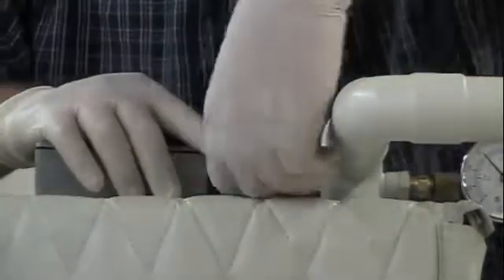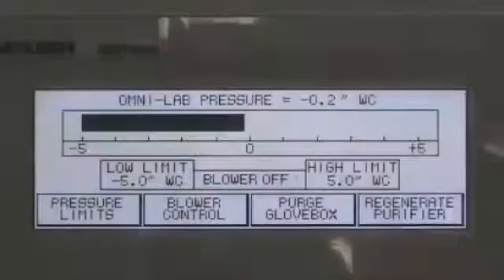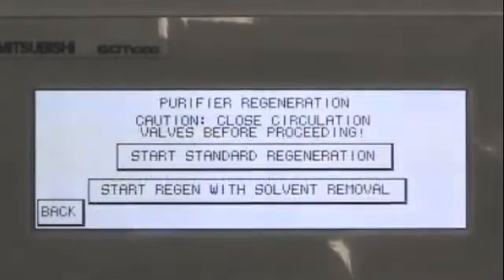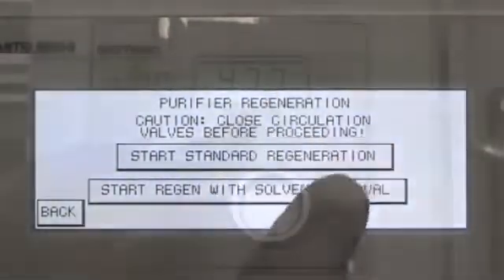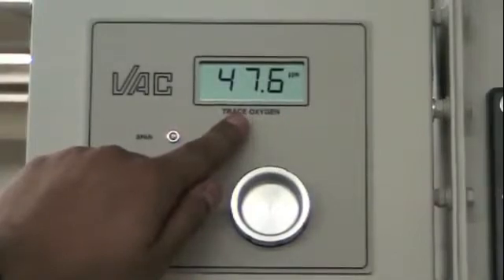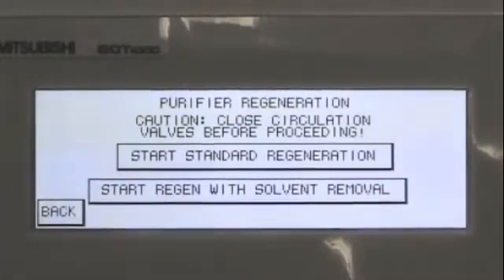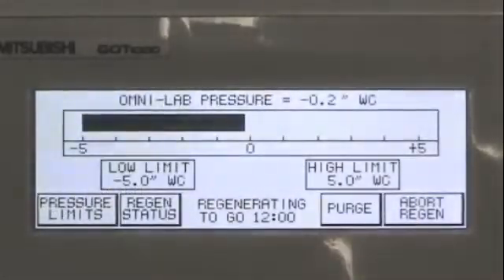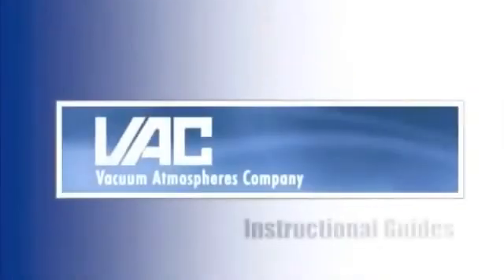And that is how you replace the purifier catalyst charge. To conclude, please perform a system regeneration. Before you regenerate, ensure that the oxygen concentration of the box has 200 parts per million of oxygen or less. Vacuum Atmospheres recommends that you regenerate two to three times for optimal performance.